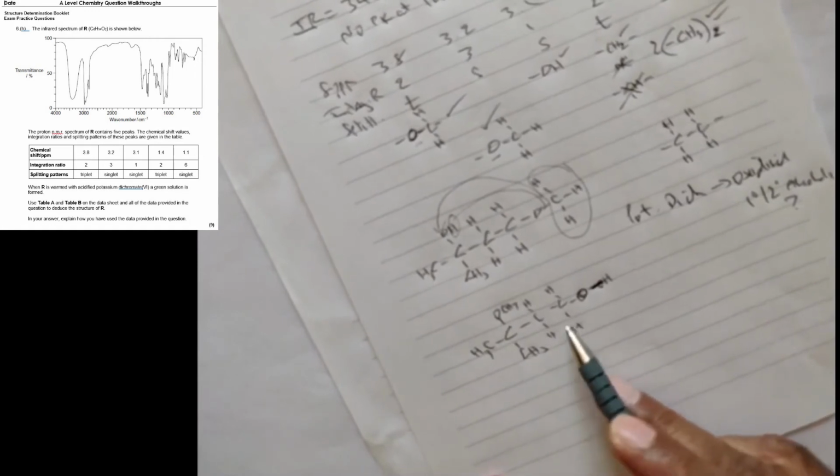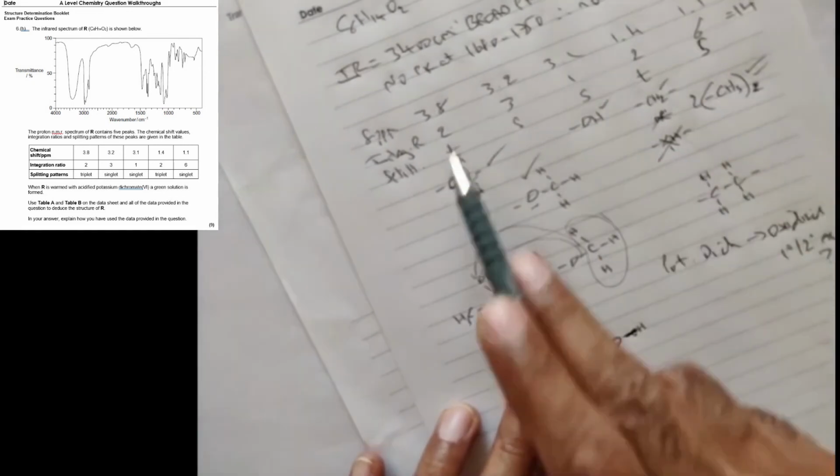Yeah, just confirm 1, 2, 3, 4, 5, 6. Yeah. So that is the molecule, because now that primary alcohol will be oxidized, and of course it still fits in with my molecular formula over there at the top. Now let's assume you didn't know how to do this. You could not get to that. This would still give you 8 out of the 9 marks.